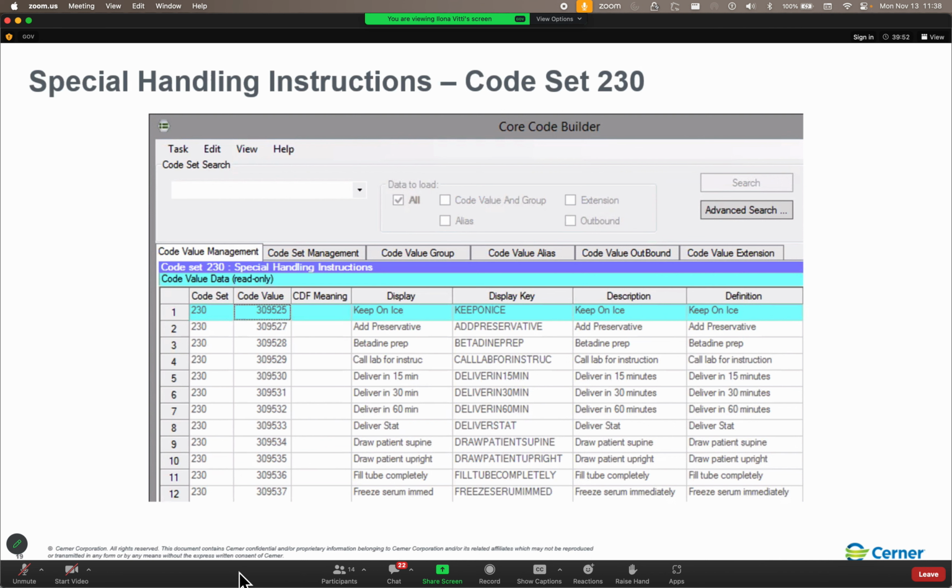So this is a case where you can add specimen types in code set 2052 and they'll work just fine for GenLab. They'll work just fine for blood bank. They'll work okay for Helix. But future micro build that may depend on that new specimen type won't work unless micro actually does their stuff too. So I recommend that we go ahead and have micro be the gatekeeper of any new specimen types in that code set. So does anybody have any questions on that?